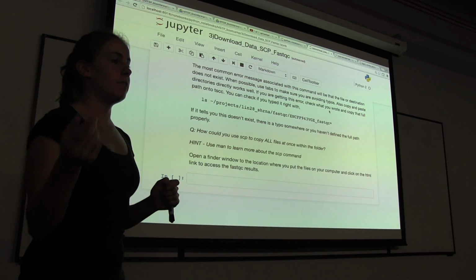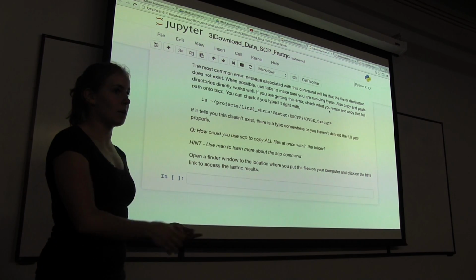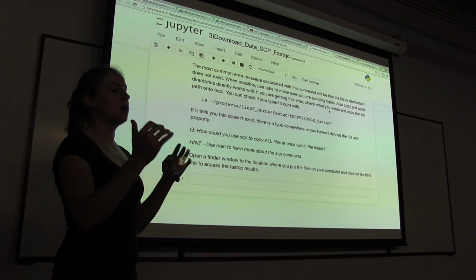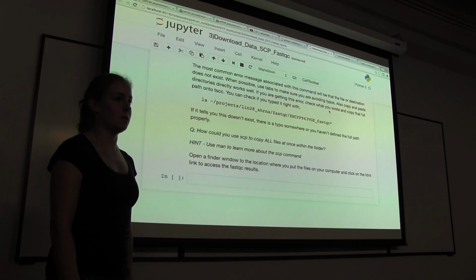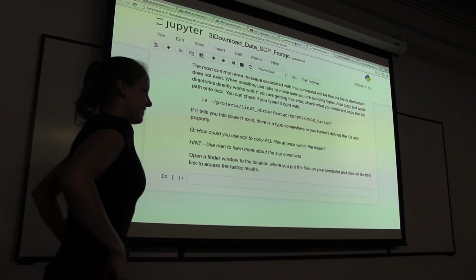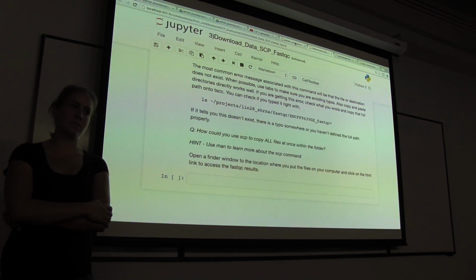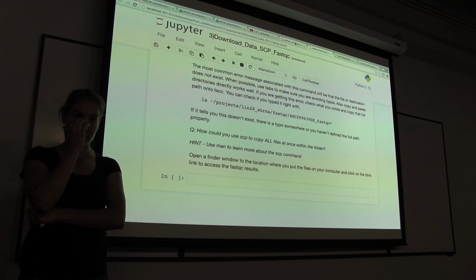But if they were not able to determine what the index was, they provide all of the files and then you can decide where you want to go with them. But the FASTQ files that we're looking at are already trimmed to just the reads that were associated with a given index. One reason that happens is sequencing errors. Another, unfortunately common, reason is when you submit your samples for sequencing, you fill out a manifest that says what the 6 base index sequence is, and it is not impossible to mess that up. And it's a huge pain for IGM or other students to go back and process the data to fix that. So just be careful.